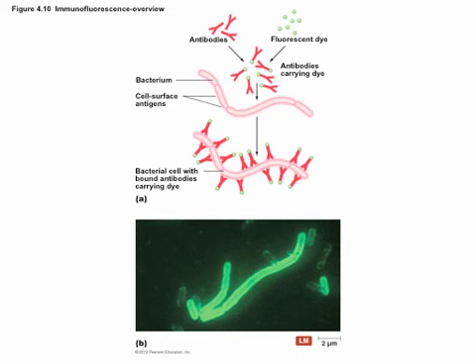So you can see here, these are antibodies with the dye on them, and these antibodies are to the cell surface of these bacterial cells, and they're going to coat the surface of the bacterial cell. And you can look at this bacteria, and you can say, whoa, that's definitely a nice contrast increase, right? No problem seeing the bacterial cell. And the really nice thing about this, as it's different from dark field microscopy, is with dark field microscopy, everything that's there gets lit up. With this, you could, for instance, have one antibody that labels E. coli. This E. coli could be in there with a bunch of staph and strep and whatever. And as long as those antibodies only stick to the E. coli, the only thing that you're going to see is the E. coli.